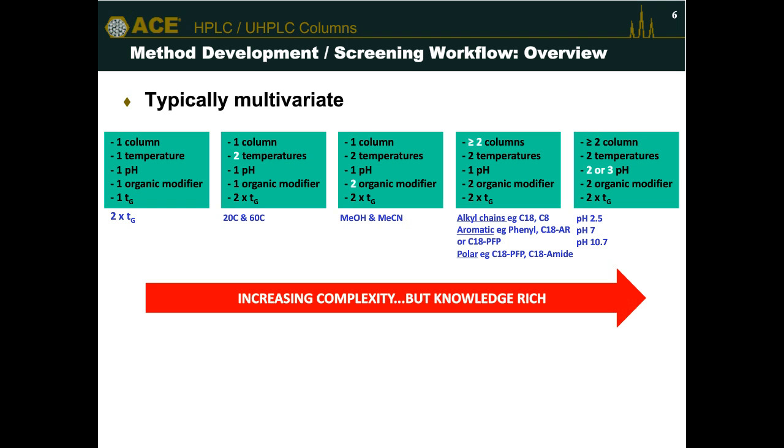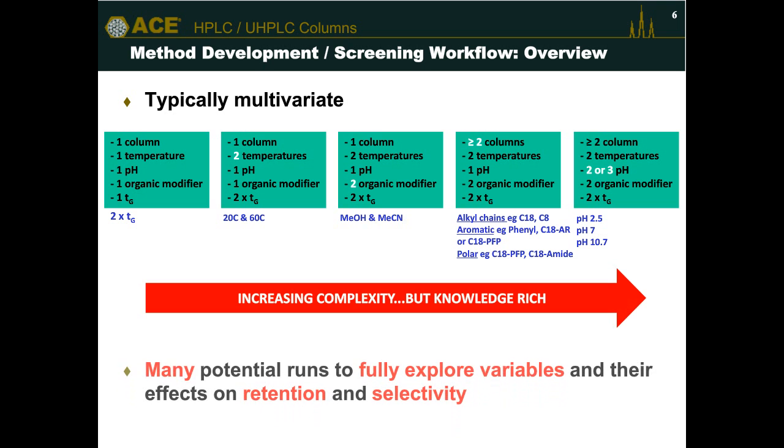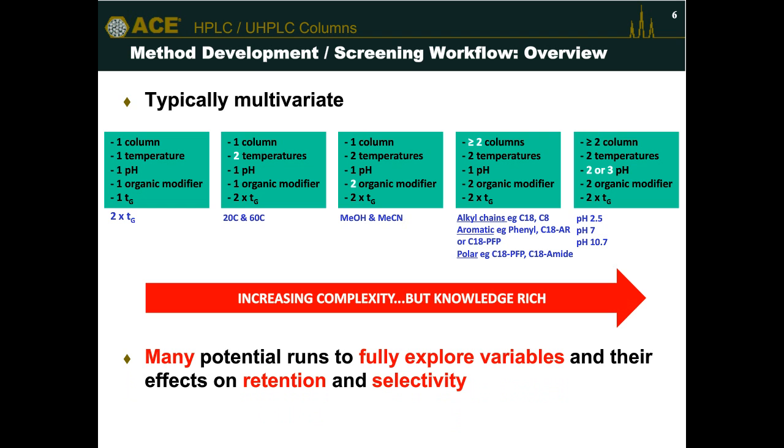And of course, as we perform injections and we change one of these parameters, we gain new chromatograms, we gain new knowledge with respect to our method development. But of course, it takes more time. And whilst we're generating useful retention knowledge, are we getting closer to our final method that's suitable for the analysis we're interested in? So possibly there are lots of different runs that you can perform. And as I'm sure you all know and you've all experienced, sometimes method development can feel like it takes a long time, and other times maybe it doesn't seem to take too long at all, maybe a couple of days. But this is an iterative approach to method development, one factor at a time approach to method development.